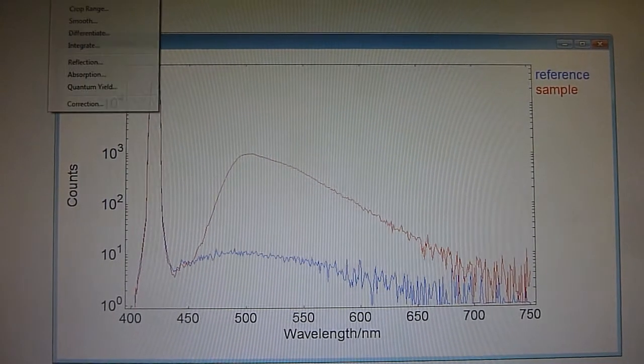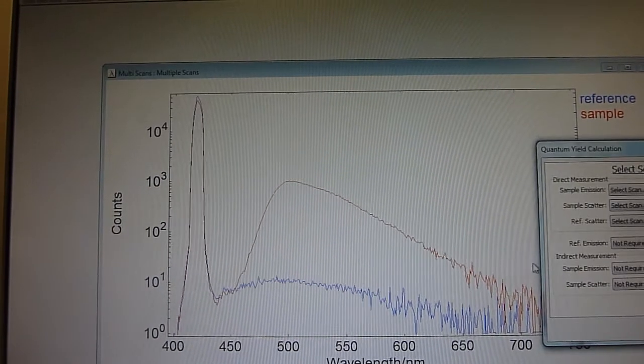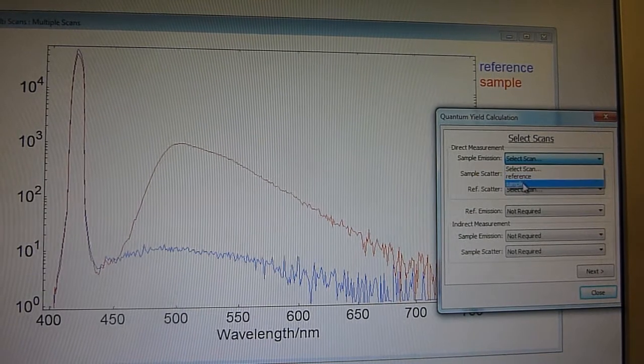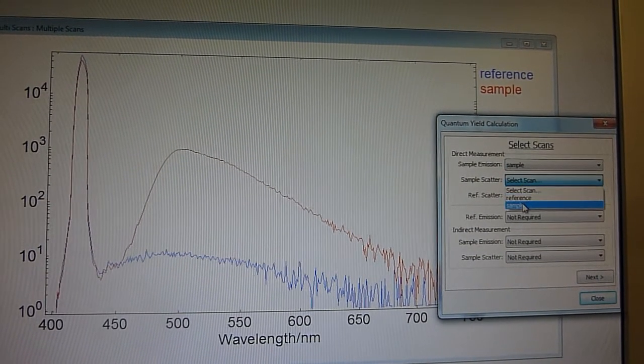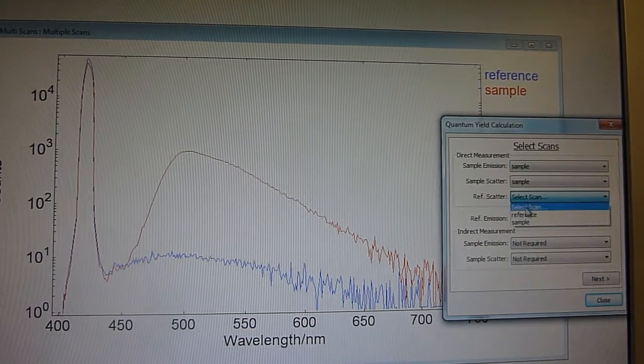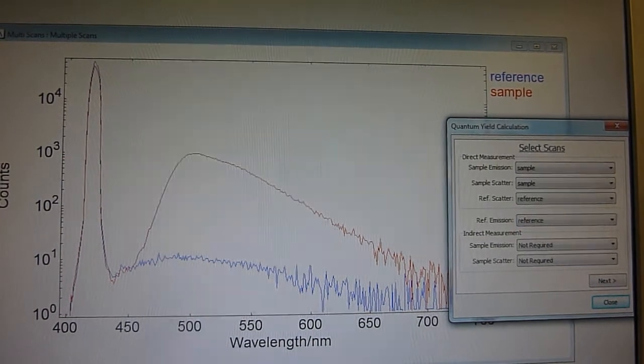So let's now go ahead and do a quantum yield measurement. We'll just click here quantum yield and let's select the sample emission is from the sample scan and the sample scatter is from the sample scan. Whereas the reference scatter is from the reference scan and the reference emission is from the reference scan.